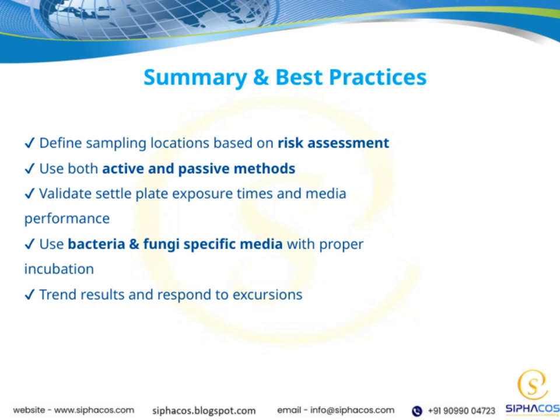It's also important to validate settle plate exposure times and media performance. Proper validation ensures the data we collect is accurate and reliable. When choosing media, always opt for bacteria and fungi-specific media, and make sure to use the correct incubation conditions for each. This specificity helps us identify and quantify what we're testing more effectively.